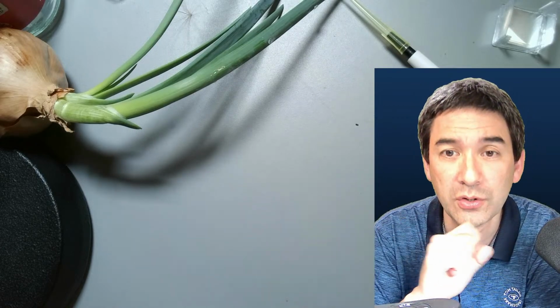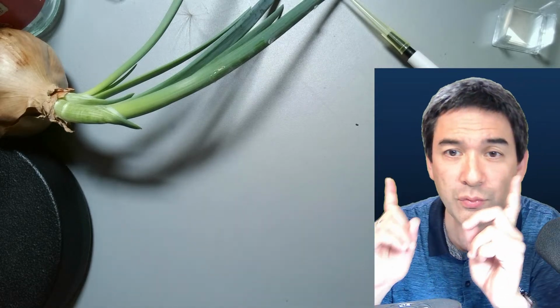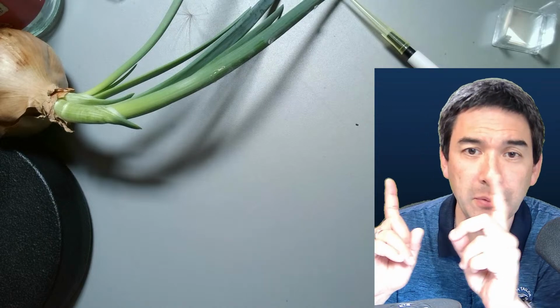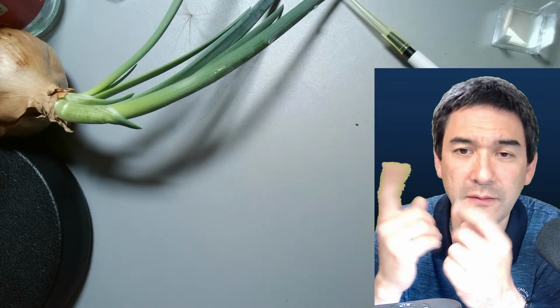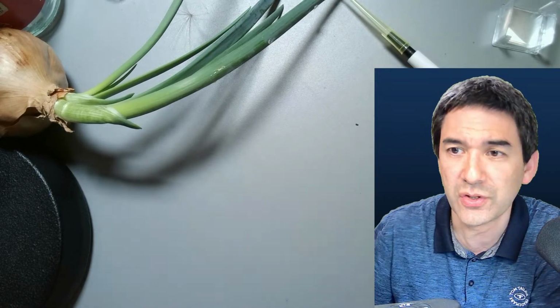That's actually not necessarily only the overexposing part, but because I've got a green screen in the background. The dark blue background that you see actually is not the real background, it's actually a green screen that I have. And if this is not properly adjusted because of the brightness, then sometimes you see those dots here.